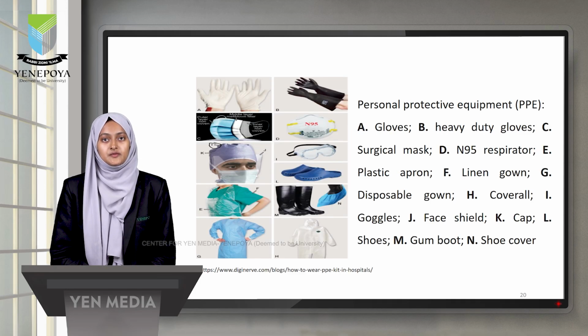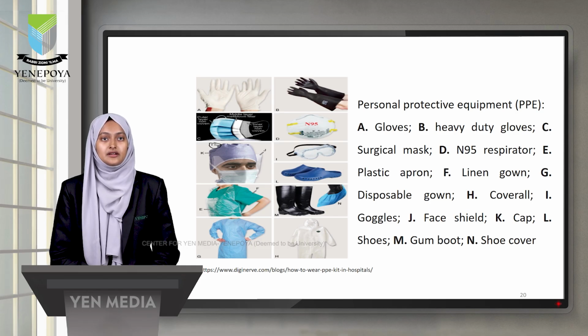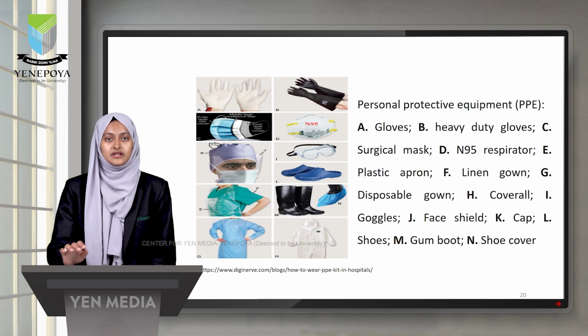So we have different types of personal protective equipment here, like the gloves, heavy duty gloves, surgical mask, N95 respirators, the head cover, face shield, goggles, shoes, plastic apron, gum boots, shoe cover, linen gown as well as coverall.